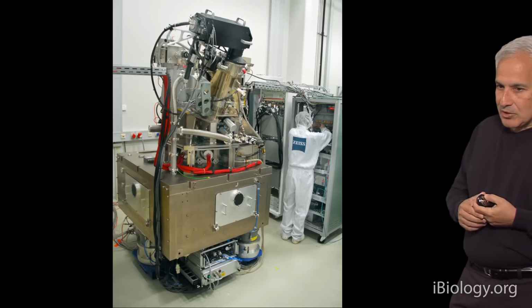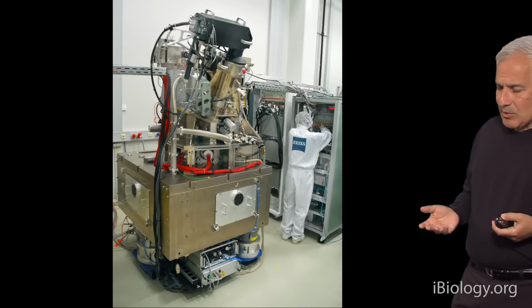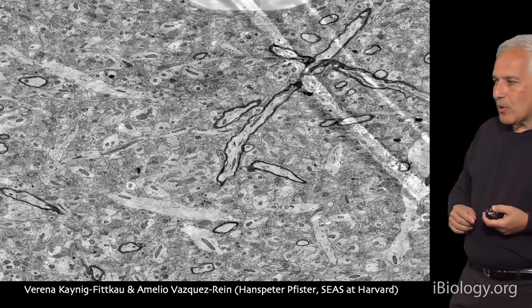So we hope eventually to be going fast enough to do serious biology with connectomes. Of course, that just gives you the images. How about tracing it? The tracing is a slow process. The area we traced before is just this minuscule part of this image.